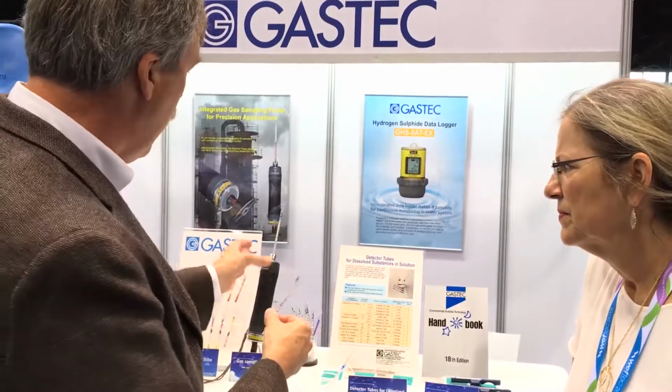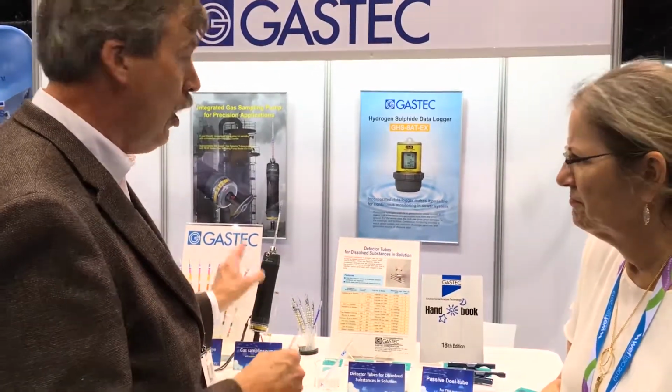Got it. So to take any of these tubes, you break the ends and you put it into a handheld device and you extract the air through the tube. This allows you to control the volume of air that you're sampling. WEFTEC has a video on their website which explains how to use this device correctly. But by the controlled airflow and the amount of material you captured in the tube, this is a great survey tool.